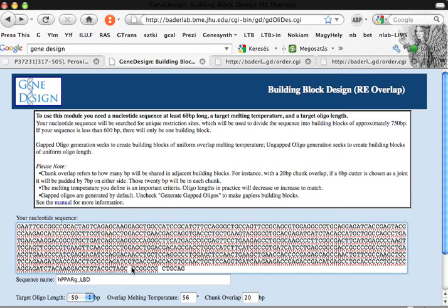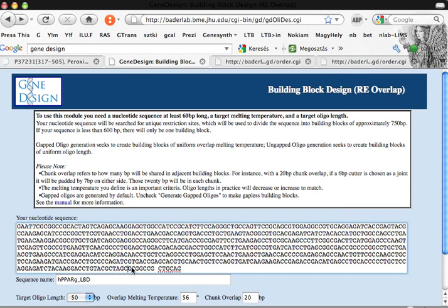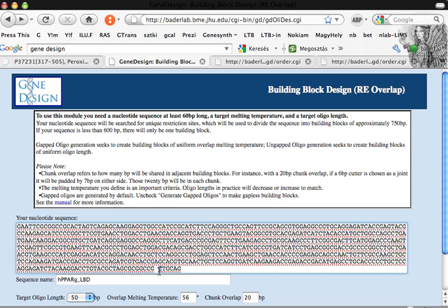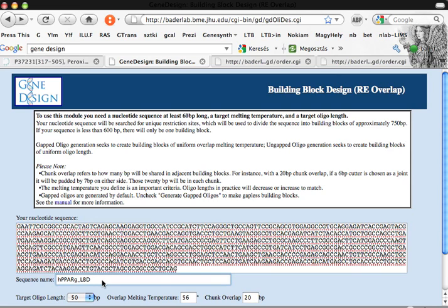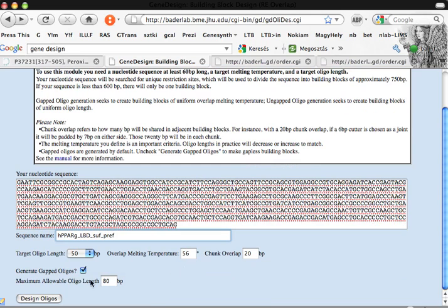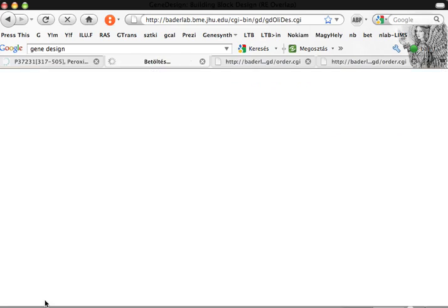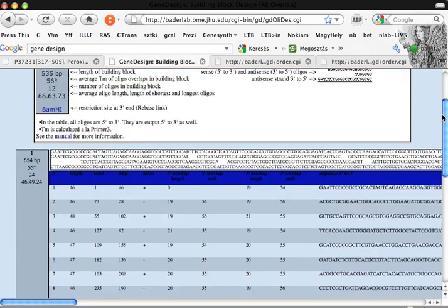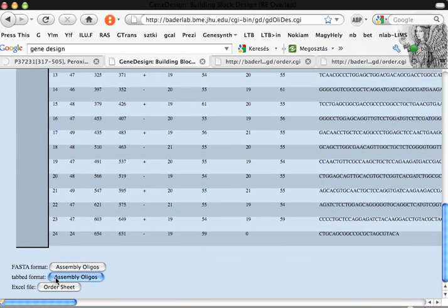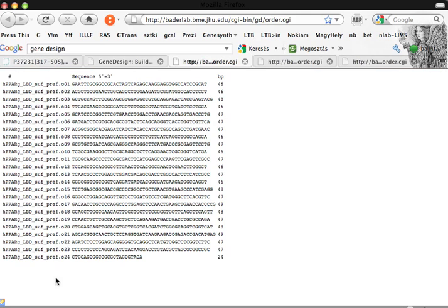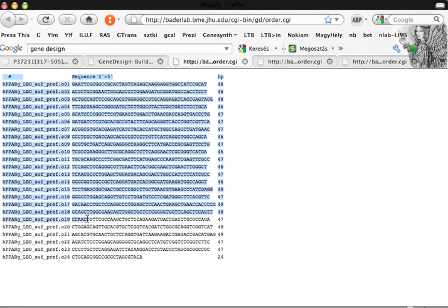Put the suffix at the end of the sequence. Take out the spaces. Write here suffix at the end of the sequence. Design oligos. And we have it with suffixes and prefixes.